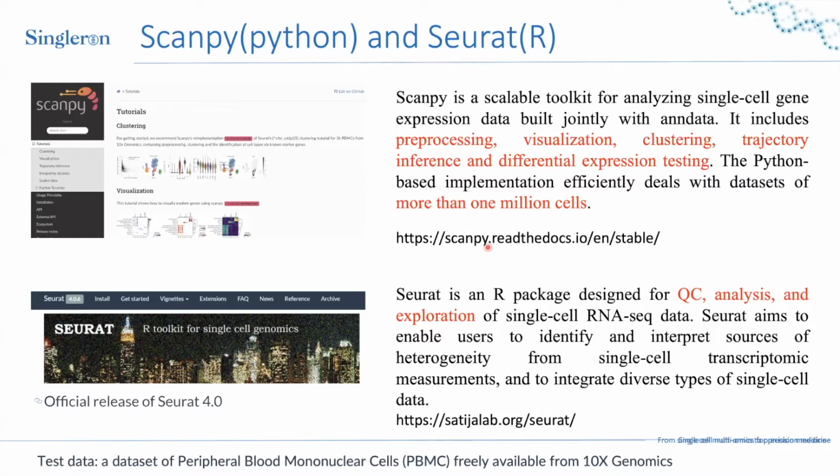On the other hand, Seurat is developed in R, and even though there will be some problems when dealing with extremely large datasets, R is very good for data visualization, and a lot of analytical tools for single cells are developed in R. So there are still a lot of people who use Seurat for the analysis of single-cell data.